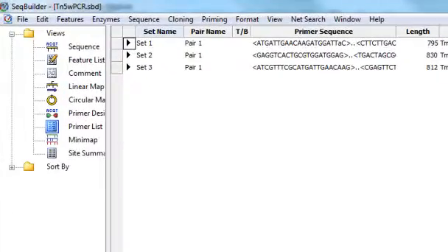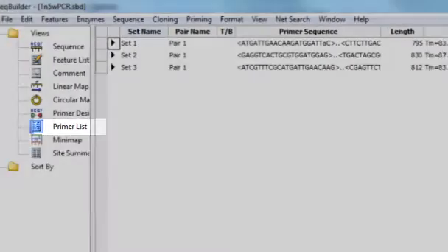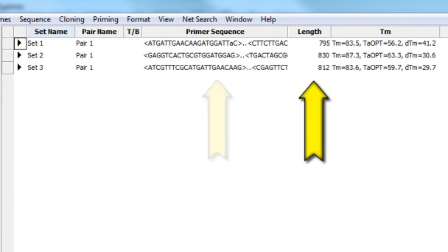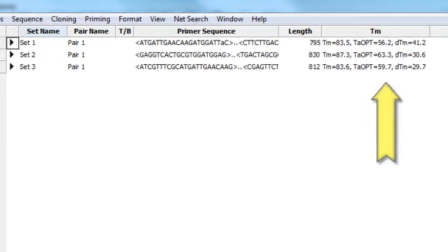The primer list view displays the results from all of the primer searches you've done for the current project. For each primer pair, the primer sequence, PCR product length, and melting temperature are displayed.